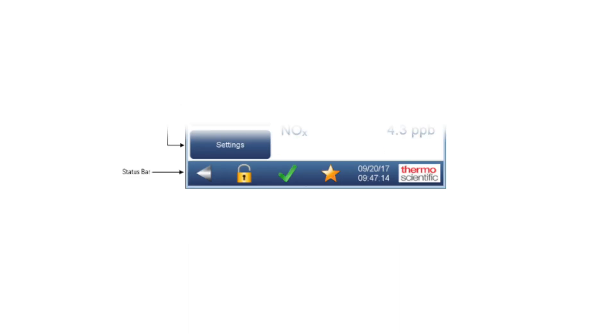On the bottom, the status bar includes a back button, access levels, help check for alarm statuses, a favorite button, and the current time.